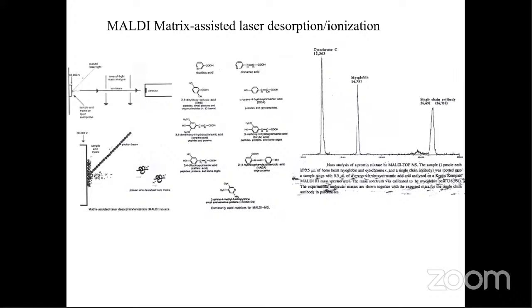If you look at MALDI, MALDI is matrix-assisted laser desorption ionization technique. So there is a matrix. Your sample is kept on a matrix, and the laser light is focused on the matrix, not on the sample. So the matrix gets excited, and then in turn excites your sample, and gives it a charge. Okay, so the laser light does not directly fall on the sample. So for very sensitive samples, it doesn't break them into fragments. So only the matrix tries to excite the sample.